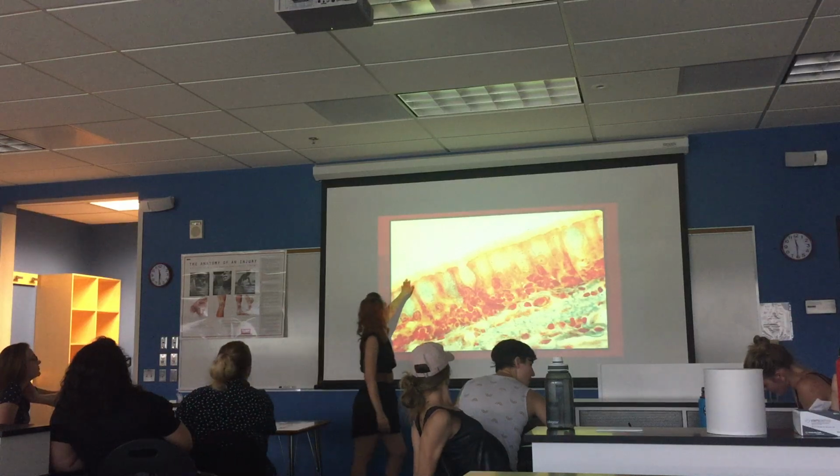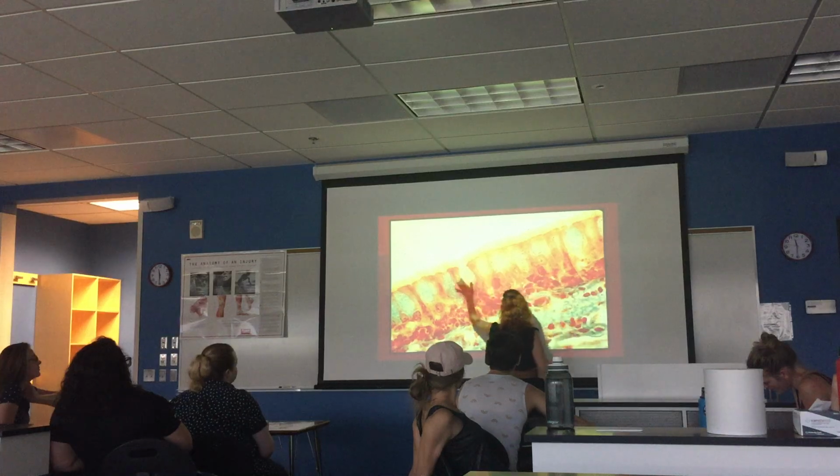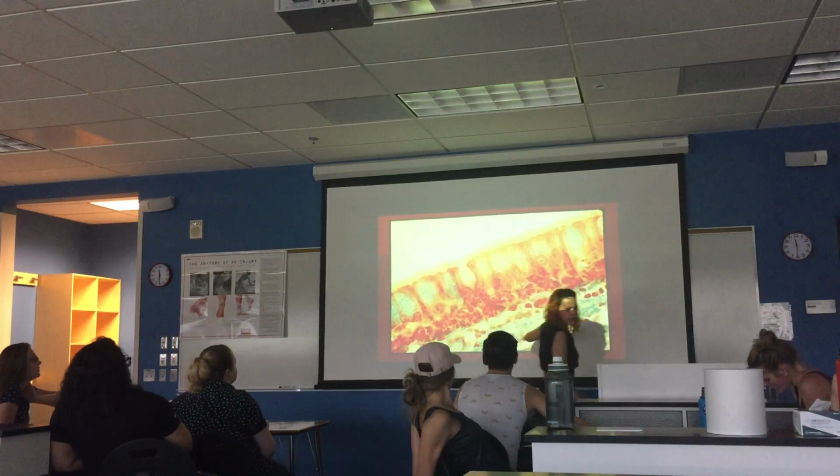Okay. Cilia, cilia, cilia. Pseudostratified columnar, goblet cell, goblet cell, goblet cell, connective tissue.